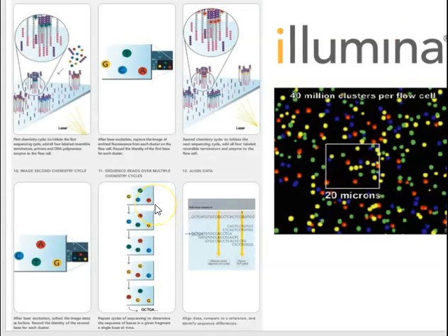Now what we can do at this point is denature it, wash it away, and leave us with our original piece of DNA here. And by repeating the bridge amplification that we've already seen, we can duplicate this piece of DNA. The green oligo at the top can fold over and meet up with complementary oligos which are still attached to the flow cell, and then we can duplicate this piece of DNA and then repeat the sequencing in the opposite direction. Okay, so you've seen the bridge amplification step, you've seen the sequence by synthesis. What you should now be able to do is follow the rest of the video and see all of the additional steps that go towards allowing a second read to be performed.